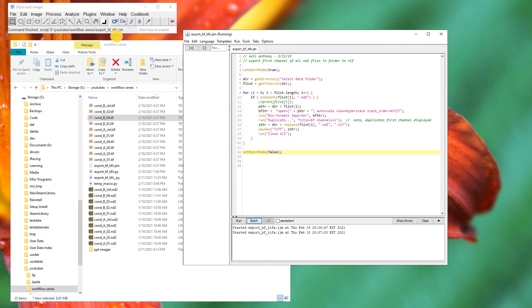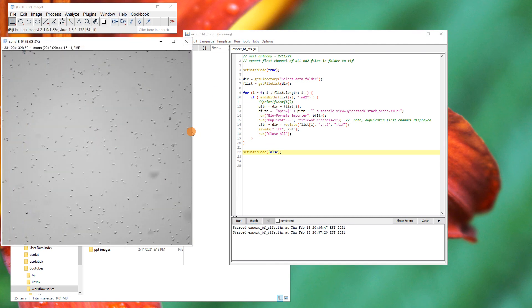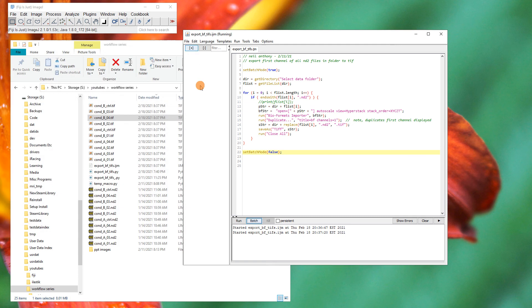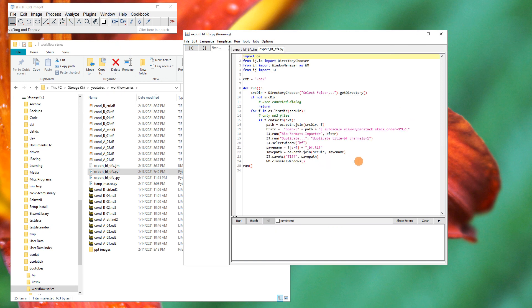You can drag the generated TIFFs back to verify they look correct — checking they're 16-bit TIFF and the dimensions are correct. In the next part, we'll do a step-by-step guide on how to make this particular macro. We'll also talk about the Python/Jython macro approach, maybe in slightly less detail, but that's available too if you'd rather use that one.